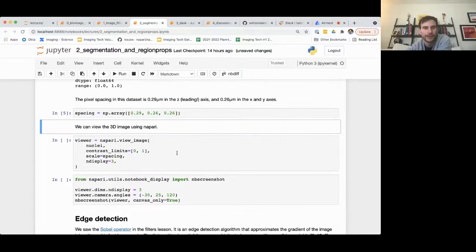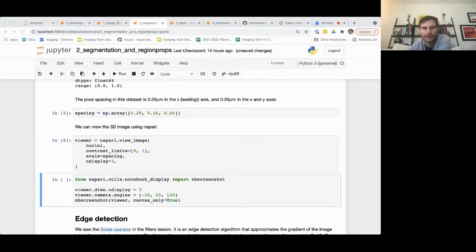non-isotropic. And then we can, again, use napari now to view these. And if I come in here and I view in napari, I'm actually now in a 3D rendering mode. And so napari can do nice 3D rendering. I can also switch out of a 3D rendering mode into a 2D rendering mode. And I can come through here and look at different images.